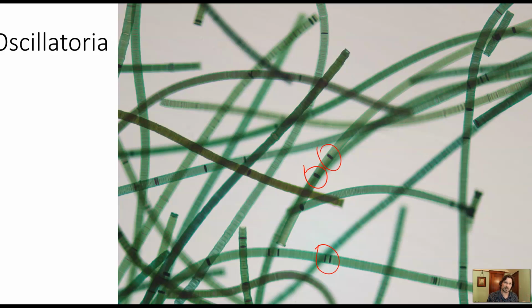I was showing you how they stick together in the capsule. Here they just divide end to end, and they're all dividing, so the filament gets longer and longer, and finally it breaks, and they have gliding motion, so they'll actually slide away from each other. And I'll show you a little video of that in a minute.